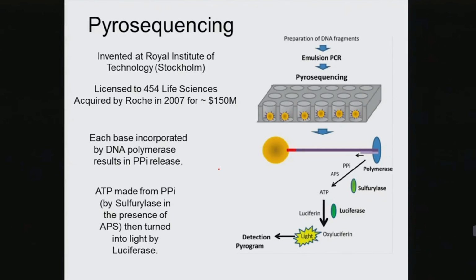And again, same thing, you're washing the bases through one at a time, okay? Taking advantage of the pyrophosphate that's being released, so you get pyrosequencing, and an indirect measure of the amount of ATP that's being synthesized.